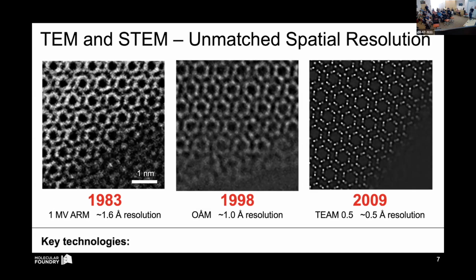So how did we actually do this? Well, aberration correction, that's the big one. Electron lenses that are round must have spherical aberration. So if you want to improve on that, you just break the symmetry. You take a north-south dipole, tip it on its side, and then do north-south, south-north, north-south, south-north, etc. in a hexapole, quadrupole, octupole configuration. Stack about 100 of these, and you can simulate negative spherical aberration and produce a nearly aberration-free image.